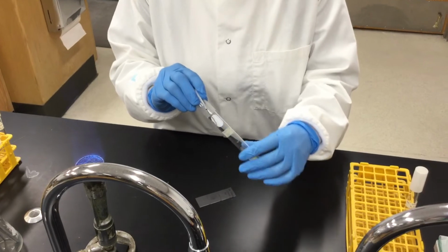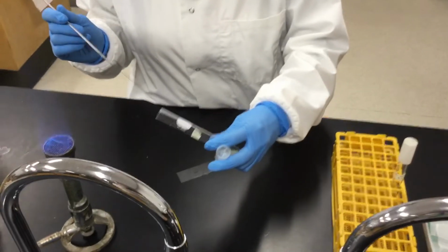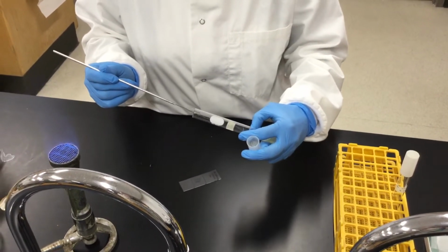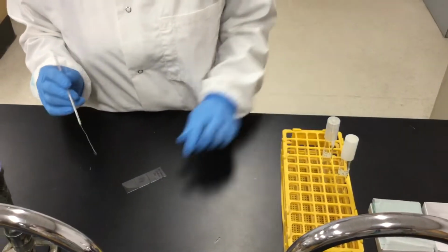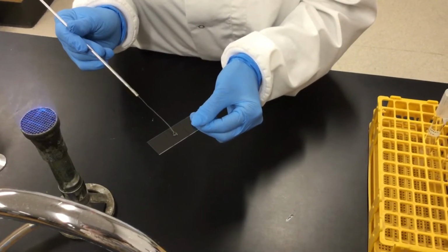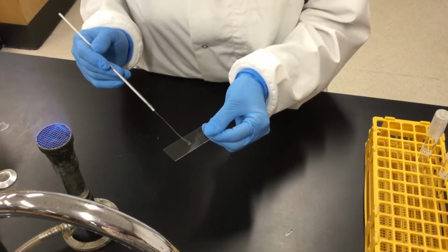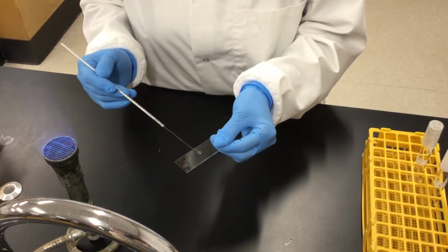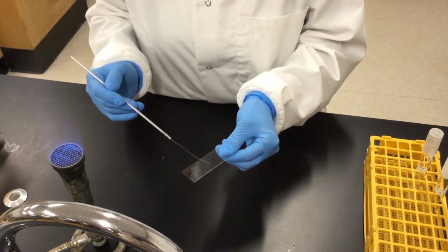So again, you have your test tube, open it next to the sterile area, pass the opening of the tube and also the cap through the flame a couple of times, and then at a 45-degree angle, introduce your loop, touch the surface, withdraw the loop, close your test tube, and put it in the rack. Then grab your bacterial sample, put it in the middle, and start mixing it with the water in a circular motion to make a homogeneous dispersion. Then you start spreading this along the area that you marked, and wait for it to dry.